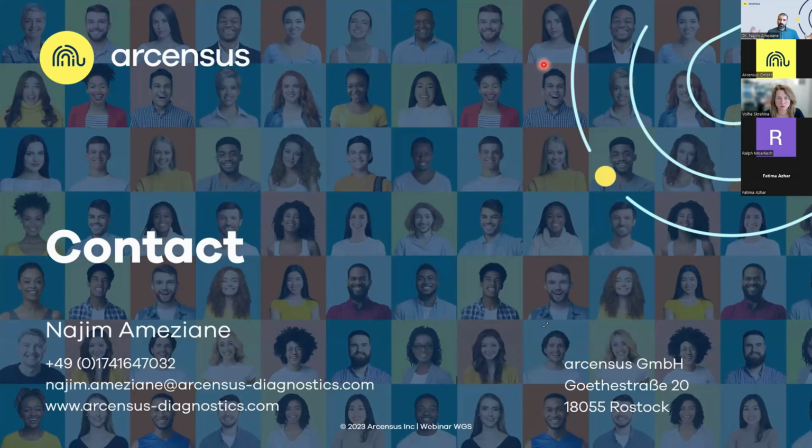So once you have spanned the entire region, you'll be able to see exactly the size of the repeat. So with long-read sequencing, you will not only be able to identify this expanded repeat more accurately, but you also will be able to identify its exact size, which is not possible with shorter reads, which give you an estimation of how many of those repeats are present in that region.